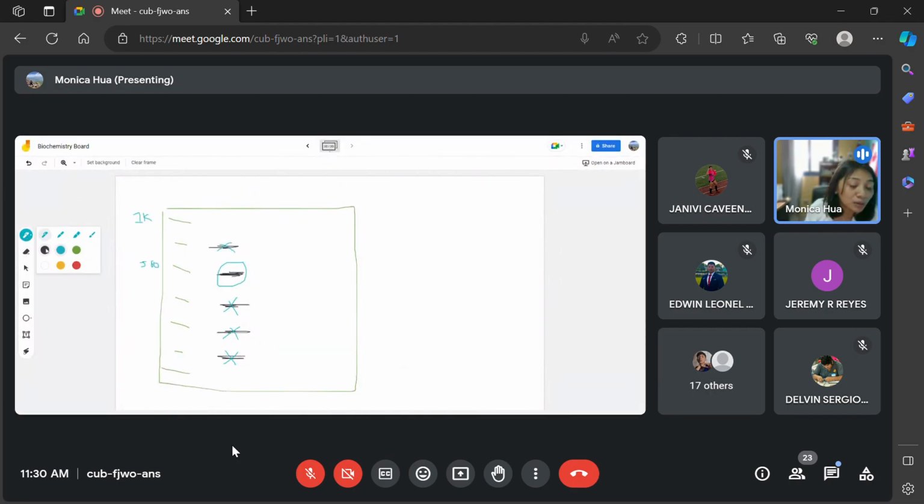So if your primer is good, you would only see one band on your DNA gel, and you could use that to continue your work. You don't have to purify it from the gel. You don't have to dig it out. You can double confirm with sequencing, but usually we would know that is the product, and you only have one band. So it just makes your life easier when everything goes perfect. But of course it doesn't, right?